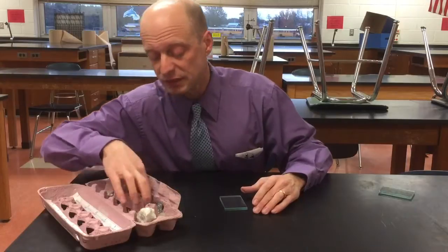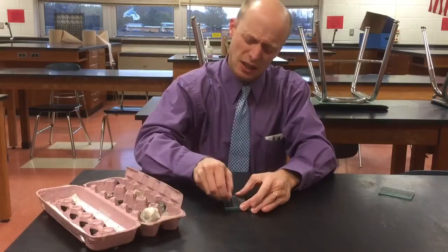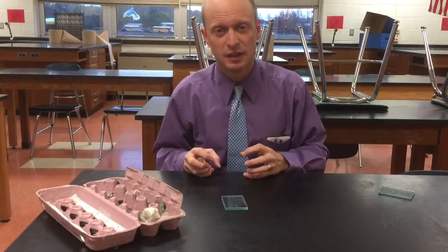This is a piece of gypsum. Eyes closed, pull it on the glass — I really feel that glide across it. It does not dig in at all. Digging in or dragging on the glass is scratching it — sometimes it's obvious and sometimes it's a little hard to tell.